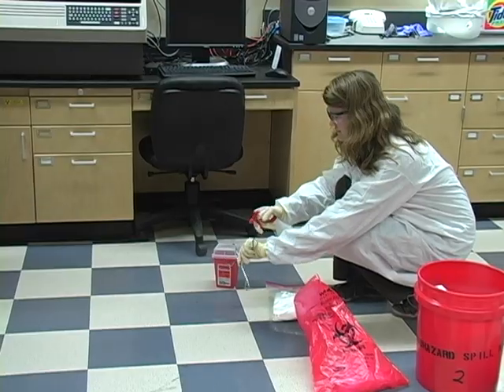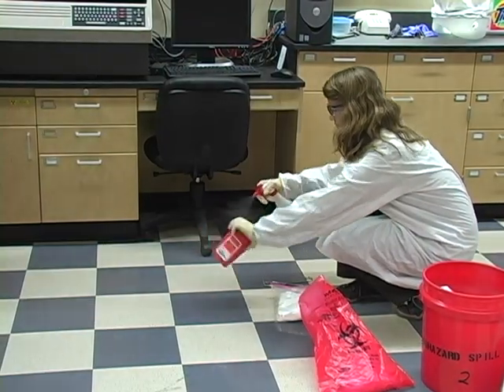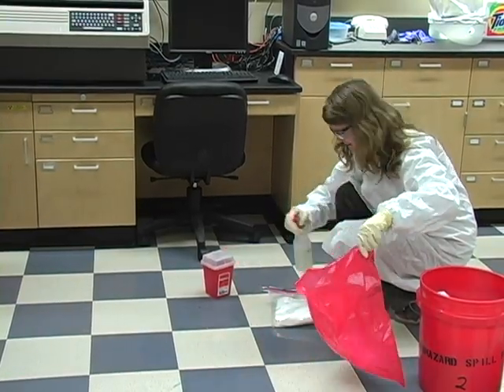The next step is to dispose of the waste. After the spill is cleaned up and paper towels and other waste is disposed of, spray the outside of the sharps container, the biohazard bag, and the tongs with disinfectant.